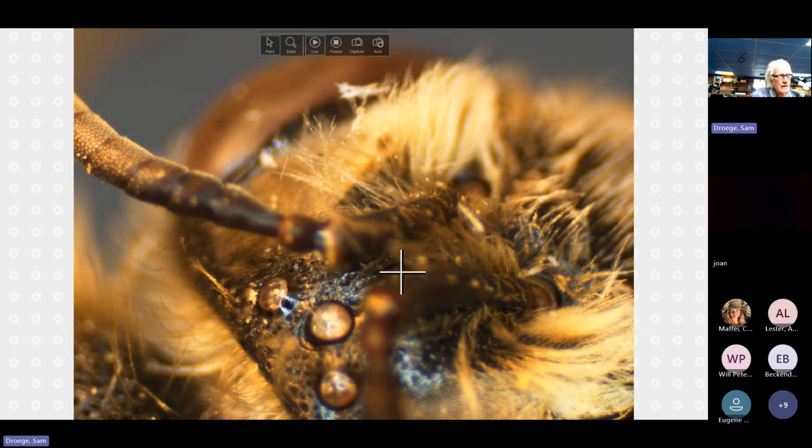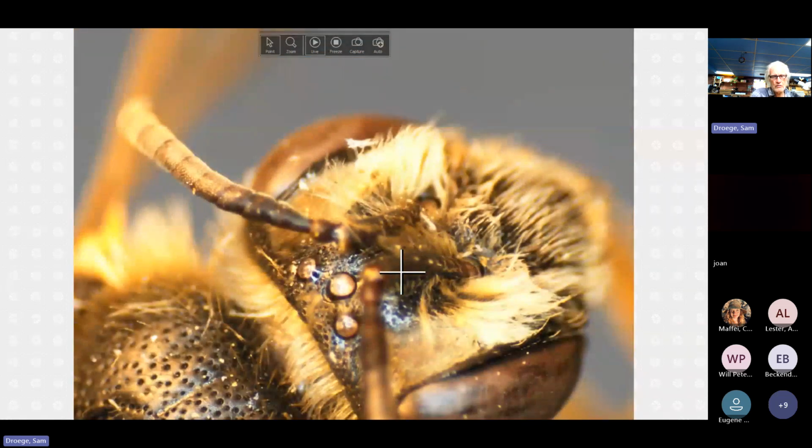Now let's take a look at the facial fovea as a contrast on here, and you can see here's the fat area, here's the thin area, and here is the edge of the eye. And first of all, the thin area is not so thin, right? I don't know what we put down there, but maybe, to be generous, and again, we may have a partially obscured specimen, this is only twice the width of that down there, and there's almost no distance between the rim of the eye and the lower part of the facial fovea, unlike the last specimen that we looked at.